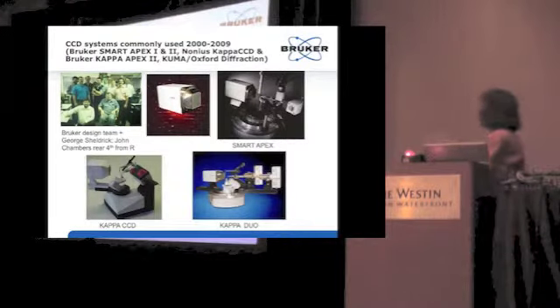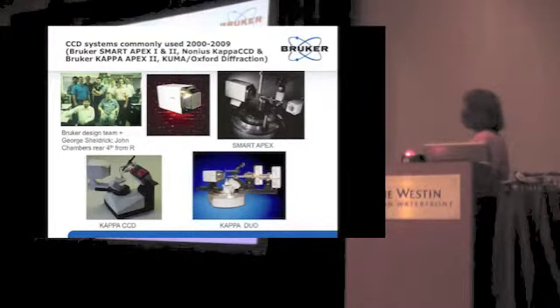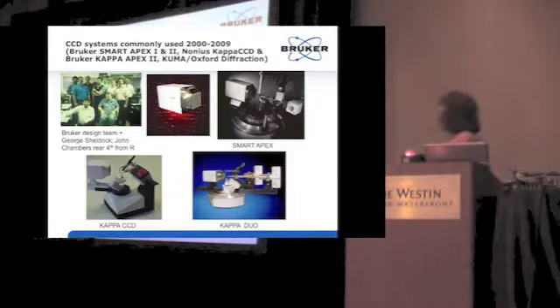And so here's what the machines kind of came into from the CAD4 automation there, and the SMART line coming into dual source Apex 2 type instruments. And here was the design team, I would say right at the beginning of the decade. And again, a treasured photo of a few people you never see.